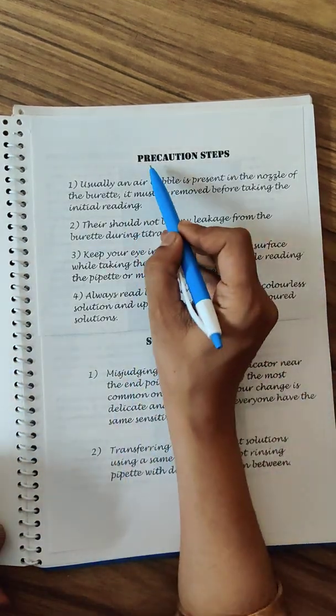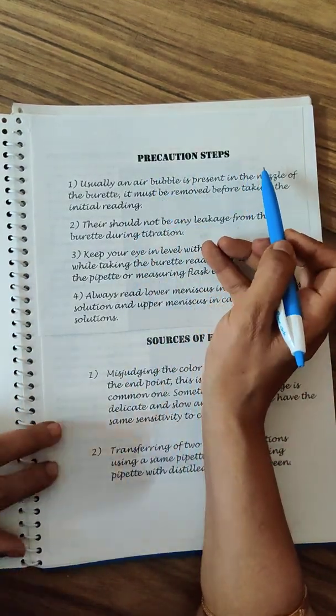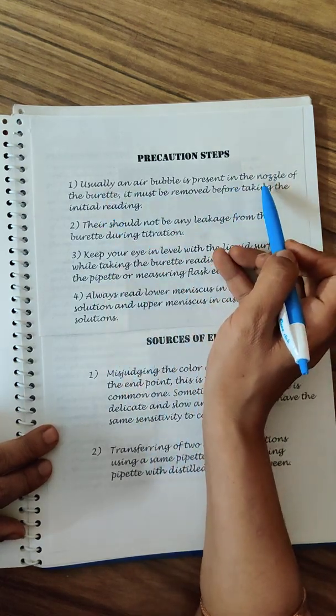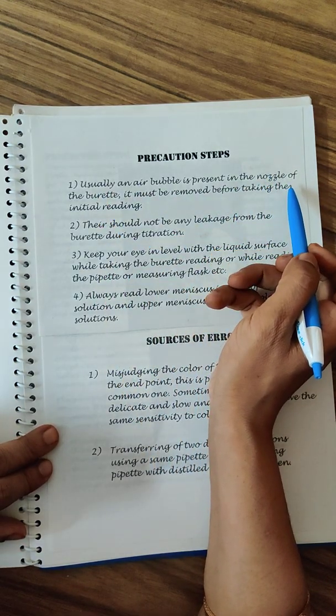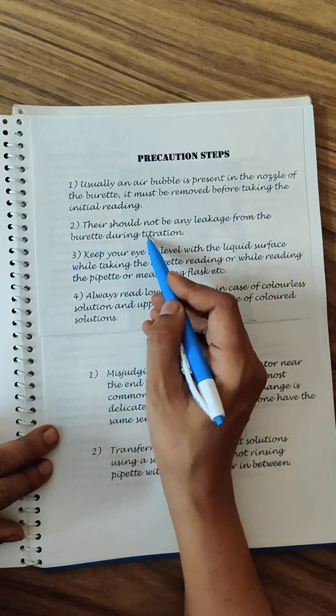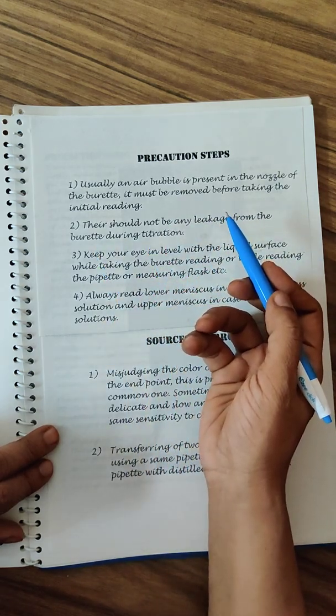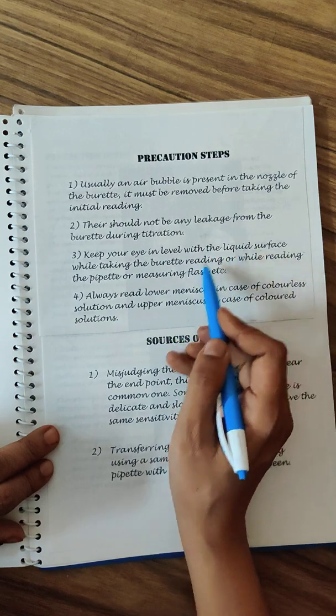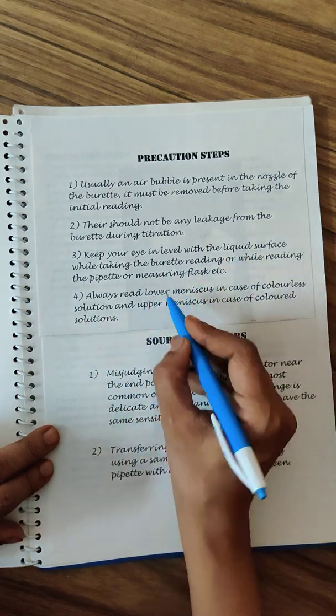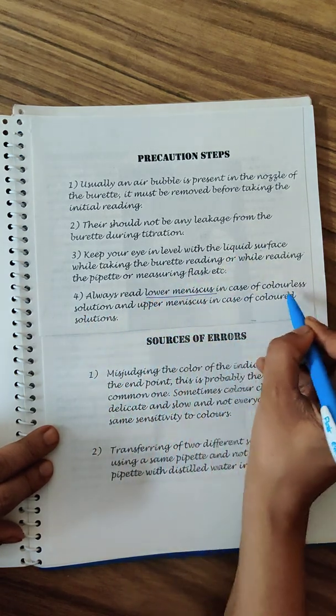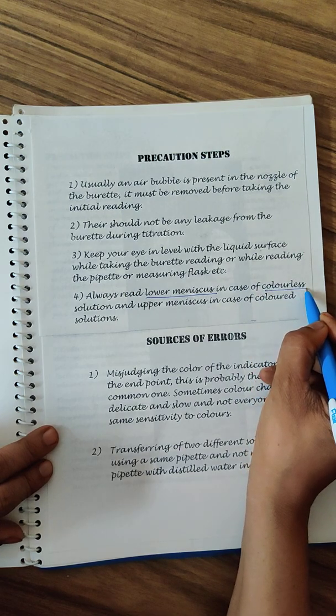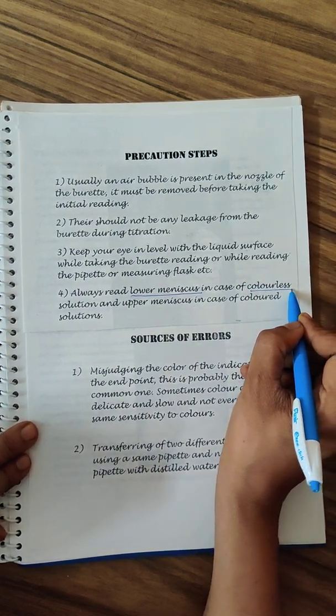You need to mention the precautions that are to be done. For example, there should be no air bubble in the burette while you are titrating. There should be no leakage from the burette. You will have to take the readings at the eye level always. You need to read the lower meniscus because the solution is colorless - your NaOH and HCl both are colorless.